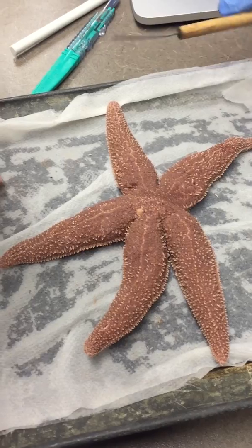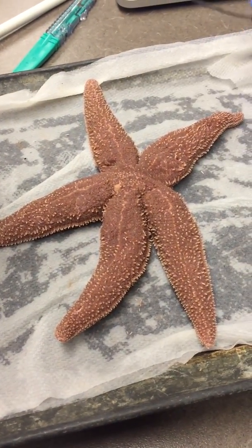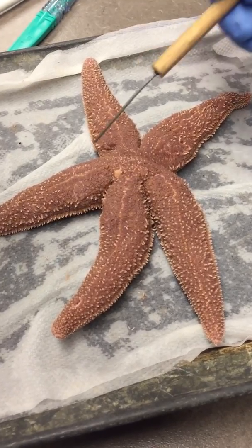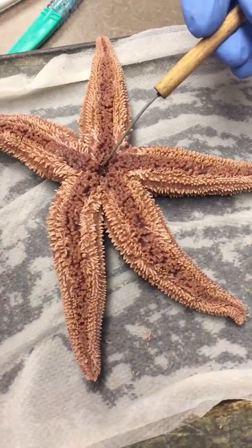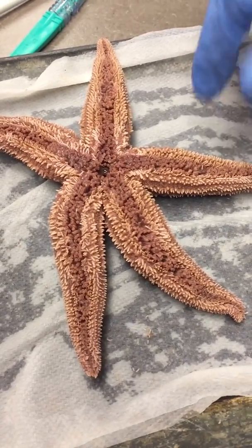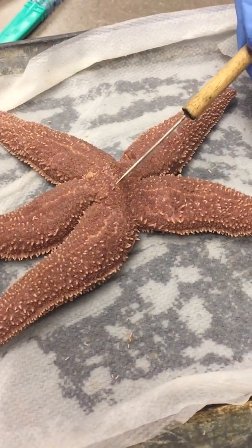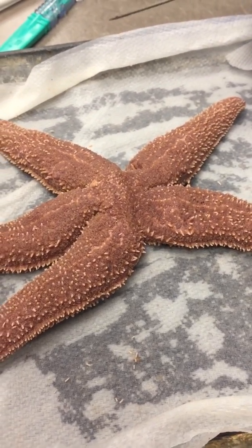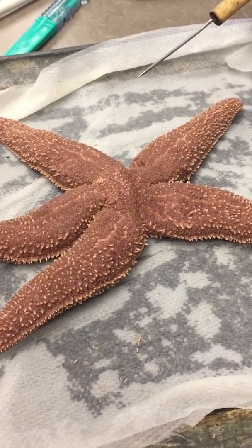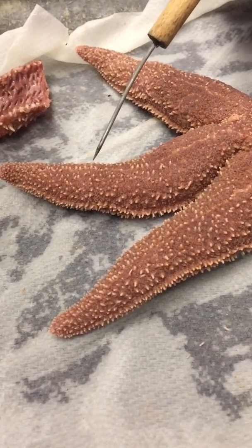The aboral surface is this top portion. The madreporite plate is this here. The mouth is on this side. The anus is very difficult to see, but it should be here. The epidermis is the skin. The spines are these individual white spikes.